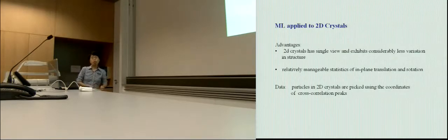So now the next thing is we want to apply this. By the way, it's maximum likelihood. We are not the first to propose using it. It has been used in single particle processing. And now we apply this algorithm to 2D crystals.